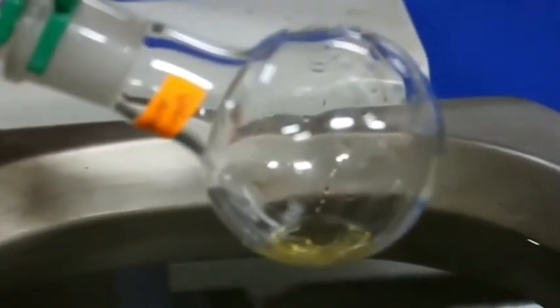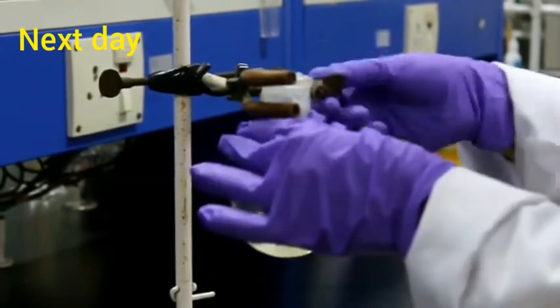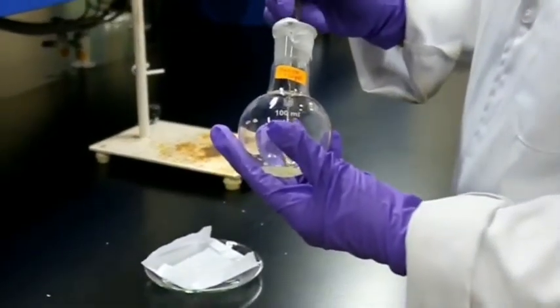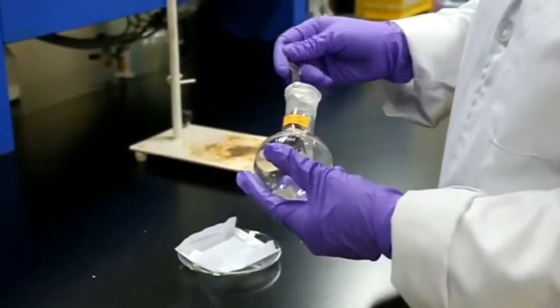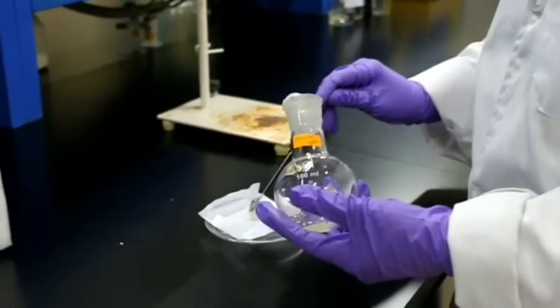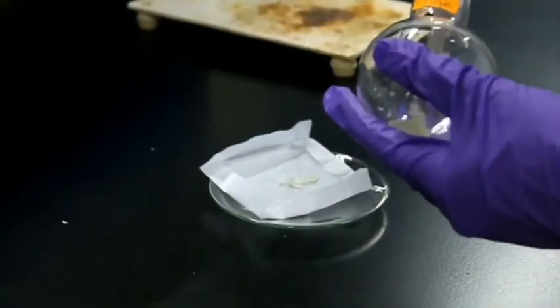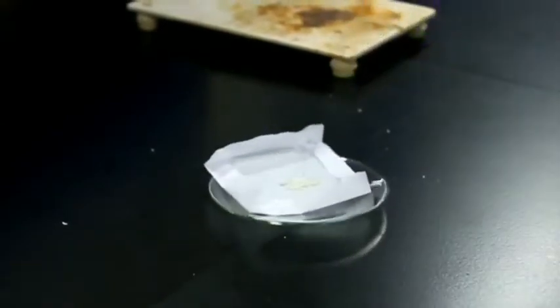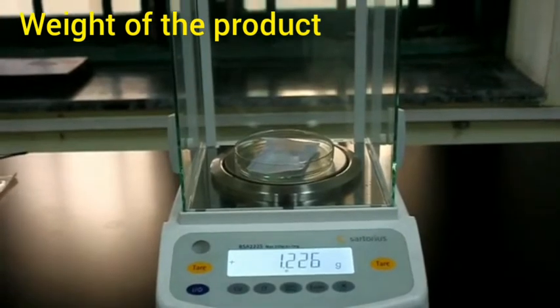After evaporation, we kept the RB flask for overnight drying and next day we are checking the yield of the reaction. So we are transferring the compound from the RB flask to a weighing paper and checking the weight. The weight of the product is 1.226 gram.